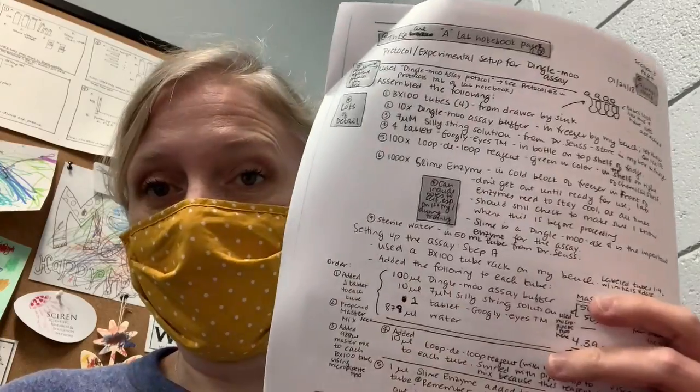And in addition to just writing lots of great notes, which you're going to do, another thing that's really important when you're keeping a lab notebook is to keep it organized. So if you just filed all of this away with no organization, you'd have all these great records, but it would be really hard to find things. You would have trouble finding things, and then I or someone else would definitely have trouble finding them.